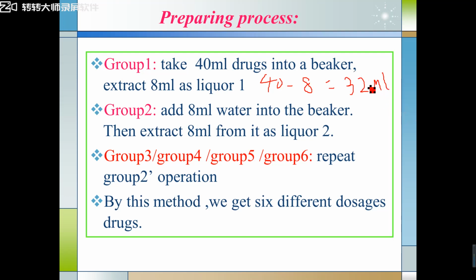So 32 milliliter of drugs plus 8 milliliter of water makes 40 milliliter again.